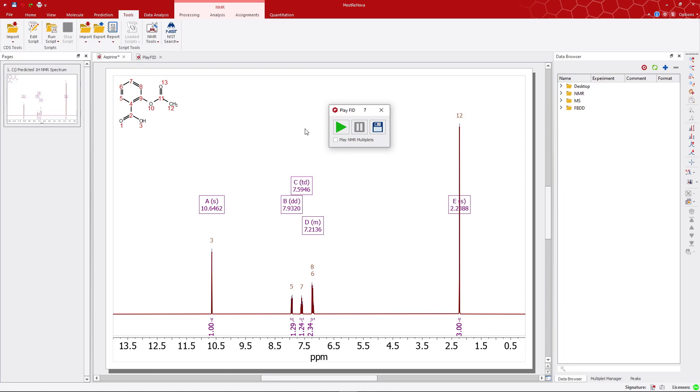Now, to acoustically render the unique sounds of the multiplets, check the Play NMR multiplets option and then click Play once more. This allows us to hear the multiplets, with each region emitting a distinct sound based on its pitch.